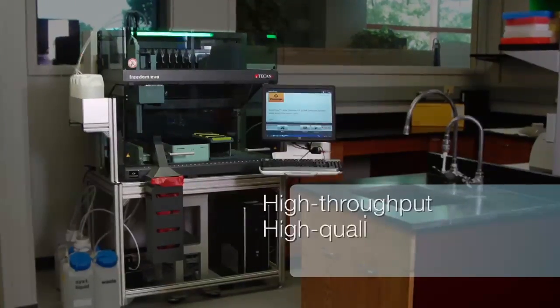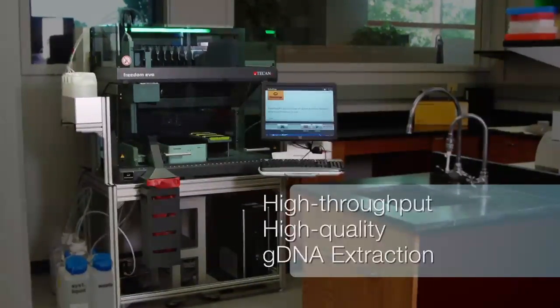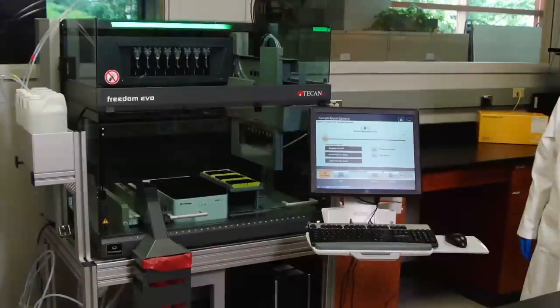High-throughput genomics laboratories must obtain high-quality DNA from large, variable-volume samples.